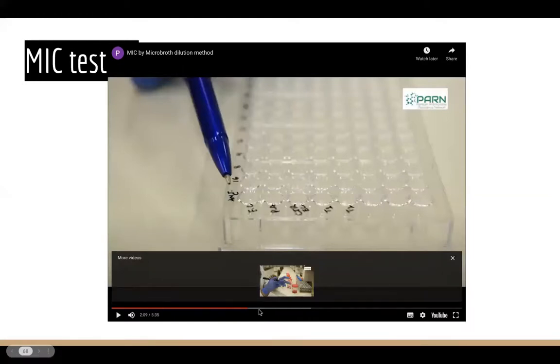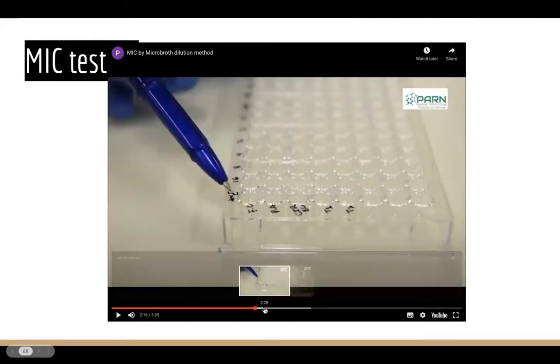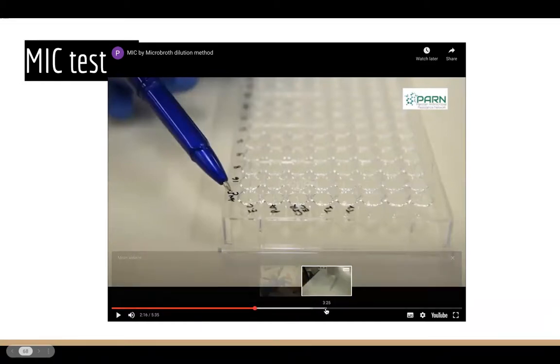So imagine if it was a 200 microliter maximum, which is the plate, they're probably working with 100 microliters of sample. And so they'll be doing 50 microliters of that, taking to the next one. And in that next one, there'll be media ready, maybe 50 microliters, and they'll take 50 microliters of that, put it to the next one, and in that way you get this dilution series. And then they tend to use a multi-channel pipette, so we'll just have a little look at that.